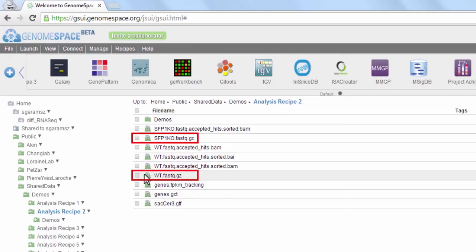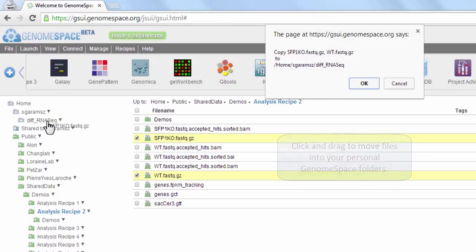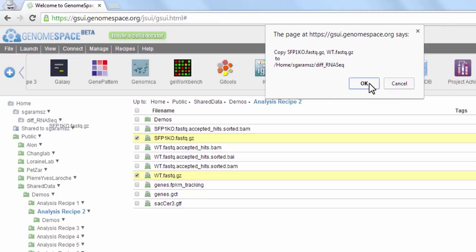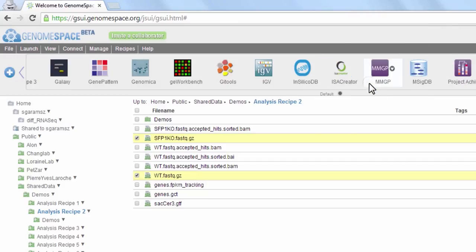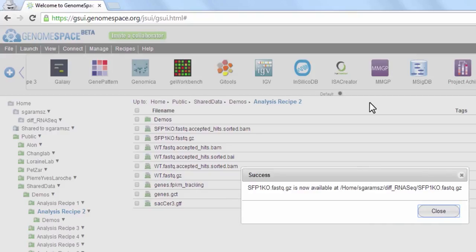Copy the wild type and mutant files to a personal GenomeSpace folder by clicking and dragging them to the folder in the sidebar. You can click and drag multiple files at once by selecting a group of desired files first. Click OK when the dialog box appears asking for confirmation.